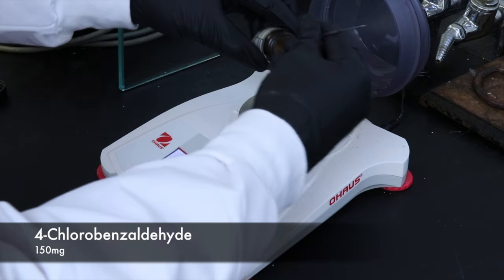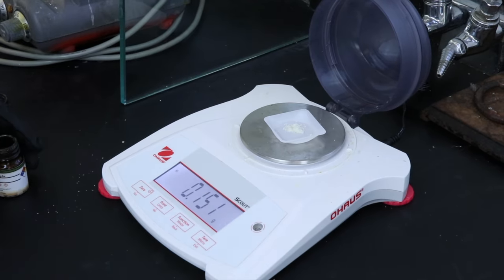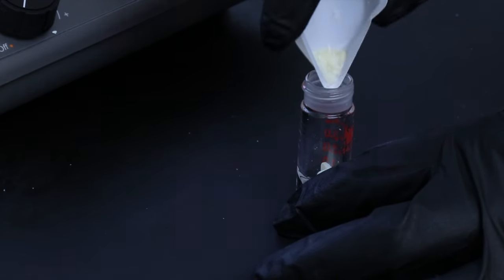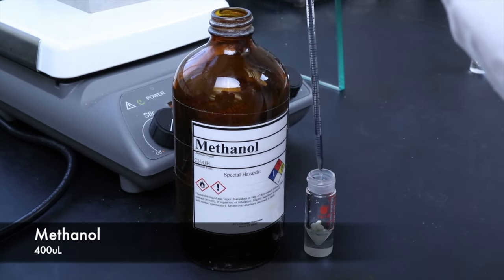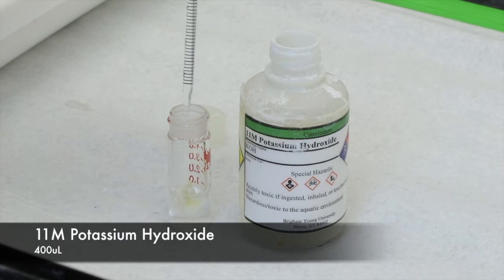Okay, I'll start out by measuring the 150 milligrams of our reagent, the 4-chlorobenzaldehyde. And then I'll go ahead and take that and put it in a 5 milliliter conical vial with a large spin vane. Then I'll be adding 400 microliters of methanol and 400 microliters of the potassium hydroxide.